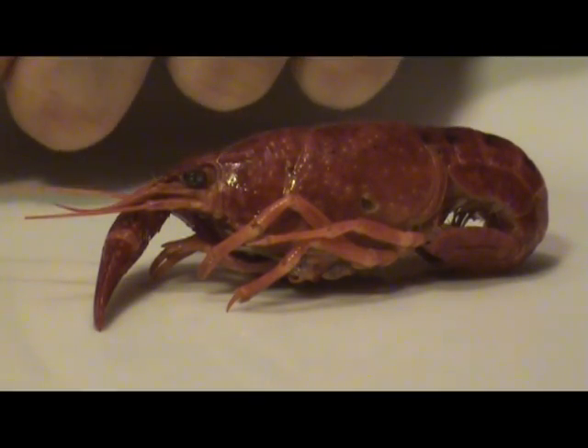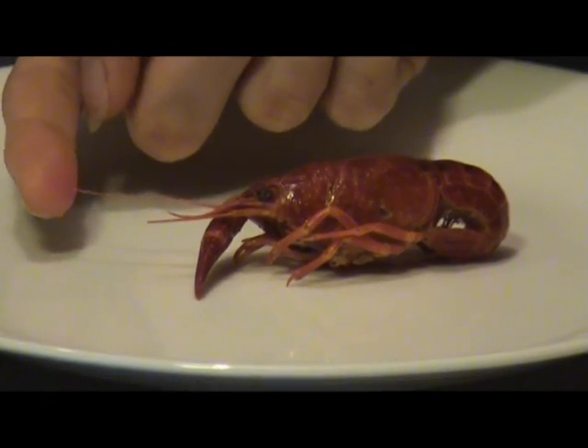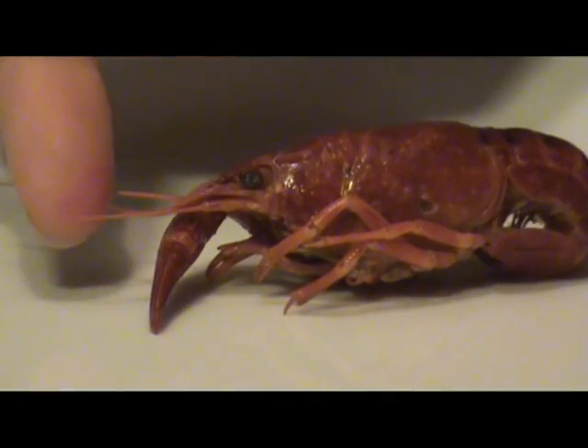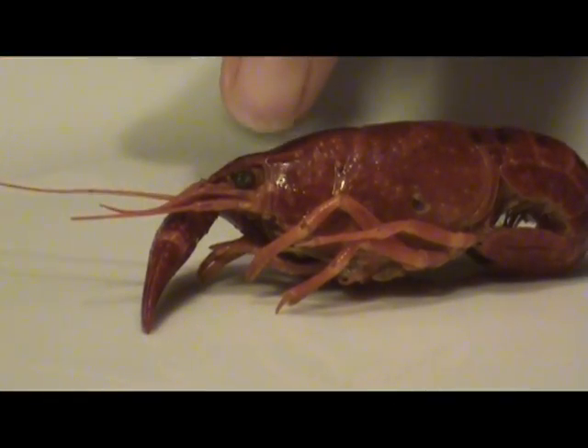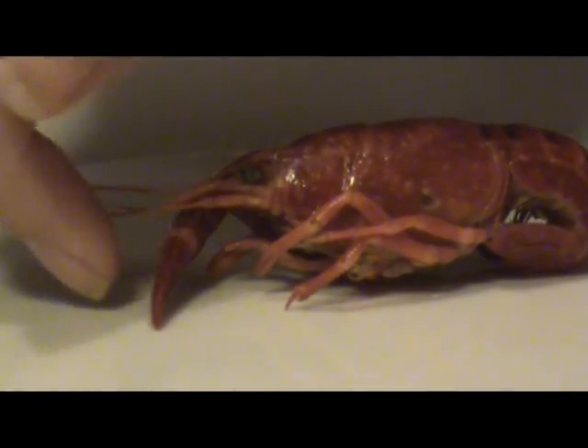This right here is the antenna, the longer of the three. These two smaller ones here are the antennual. Then you'll notice the eye stalks and the cheloped, the large claw.